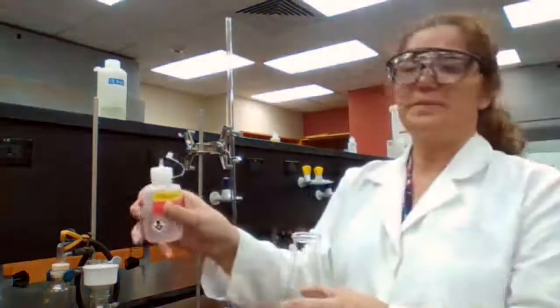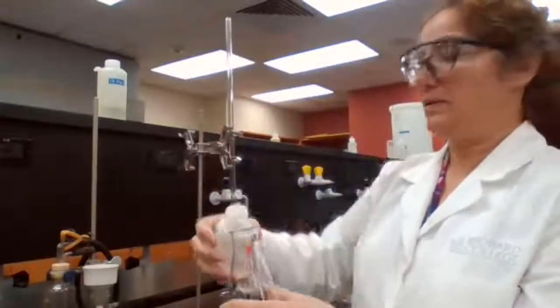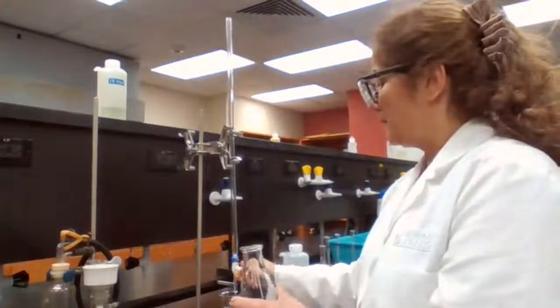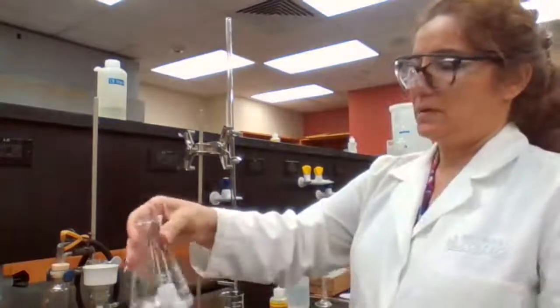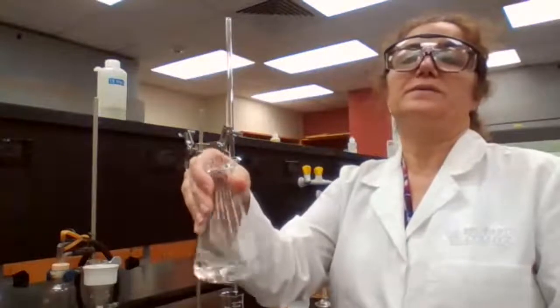And you said 3 drops of phenolphthalein. So my solution is ready. What should I do next?